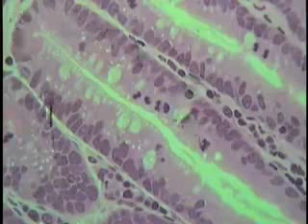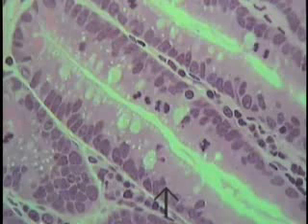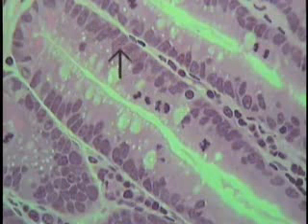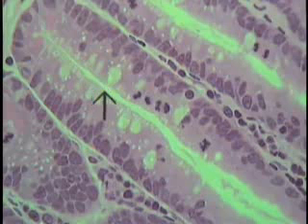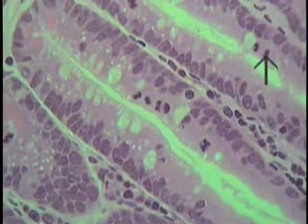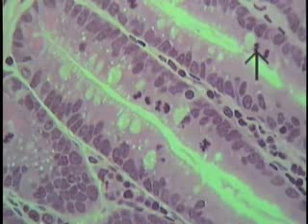This is that same tubular gland seen at increased magnification. The nuclei of cells making up this gland are located here. The cytoplasmic extent goes to about the tip of the arrow, right along this boundary. This is a mitotic figure, as is this one, and as are these over here, and these intense bodies.